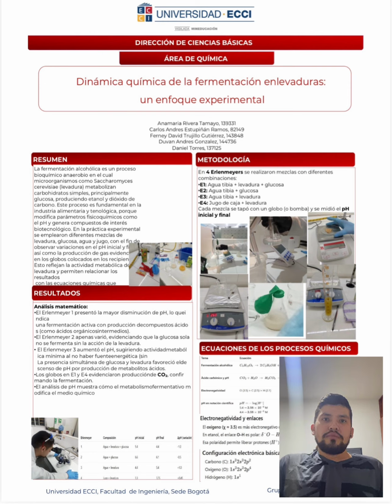In summary, this simple experiment allows us to connect theory with practice. We could observe how this metabolism depends on the availability of glucose and how fermentation alters measured chemical parameters such as pH and gas production.